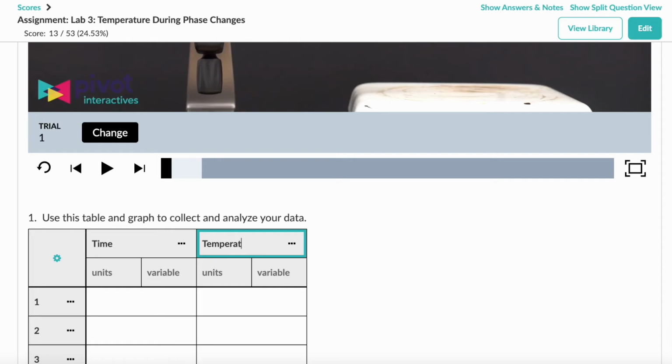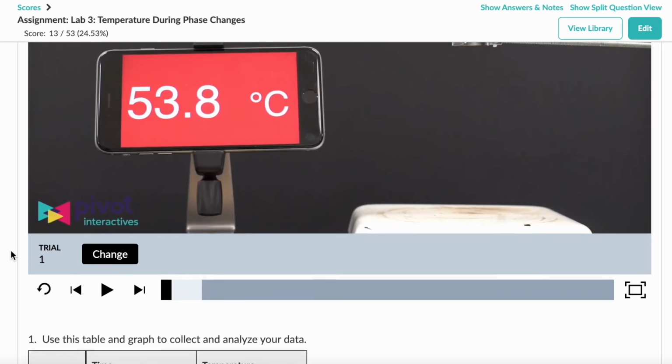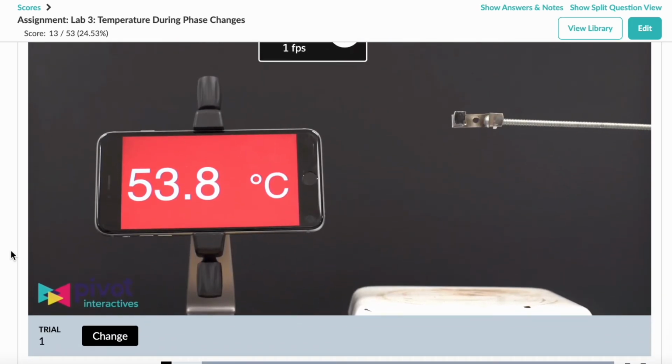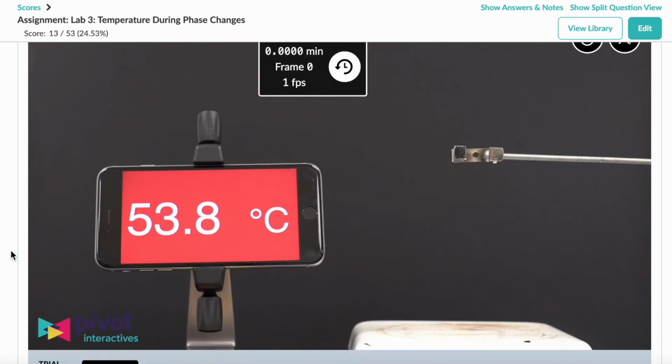So I'm just reminding you on how this is going to look. But I would like to see at minimum 35 data points. Again, not because I'm trying to make y'all suffer, not because I am making you do busy work for the sake of it. No. It's because the more data points you collect here, the clearer this data is graphically, and it helps you come to some conclusions about what is going on. Okay?